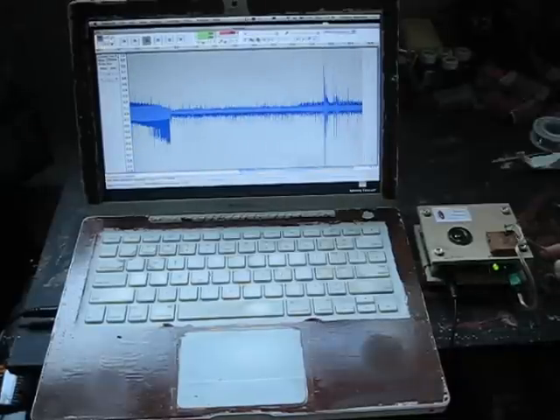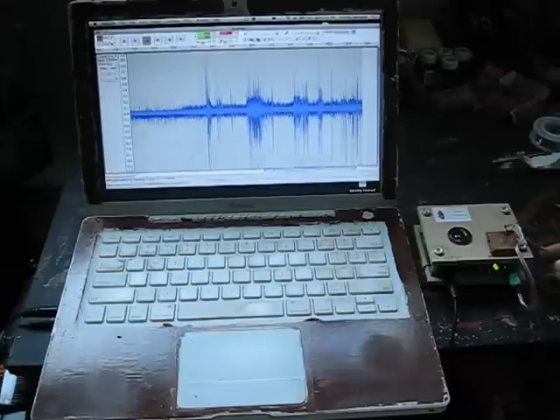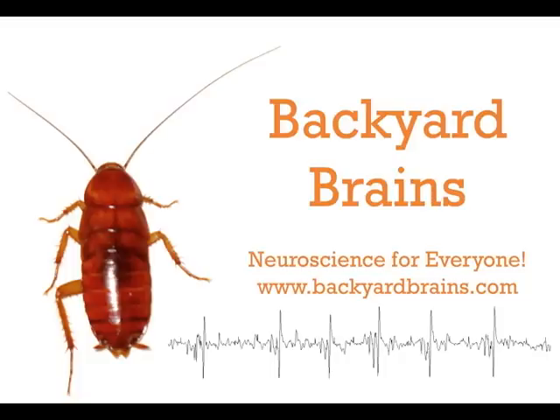And if I touch the leg with a stick, look at and hear those robust responses. The spiker box is a wonderful tool for probing the mysteries of neurons, but it is a sensitive scientific instrument, and care must be taken to ensure what you're hearing and recording is real nervous system activity. We're working hard to continually improve the signal-to-noise ratio of our spiker box, and we look forward to — and have already heard — suggestions from you on how to make your neurons as clean and crisp as possible.